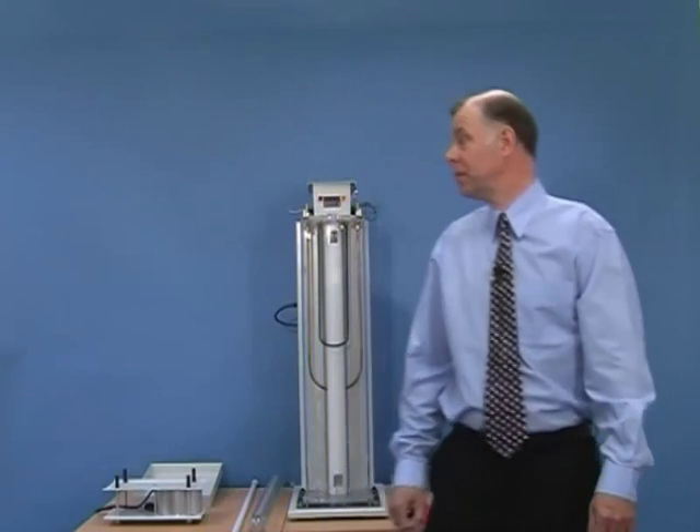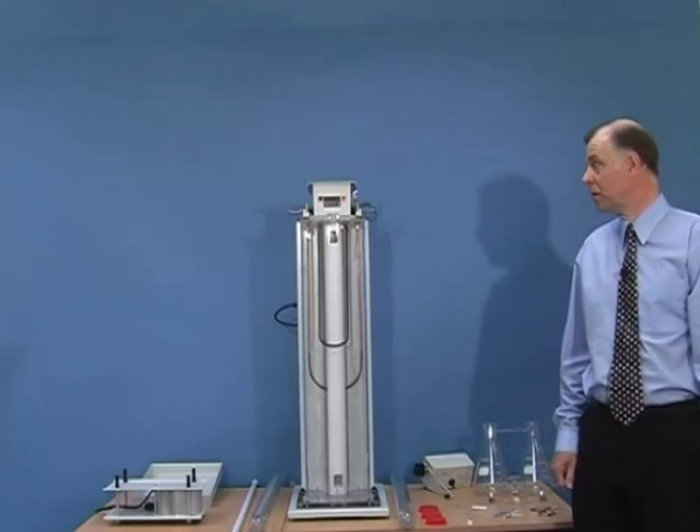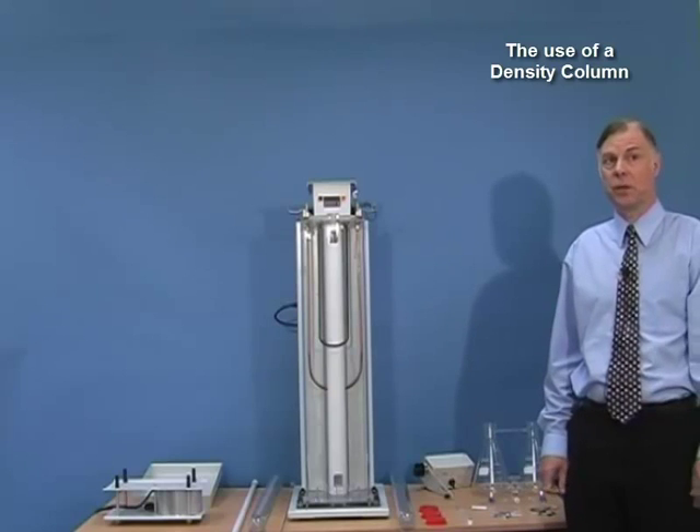Hello and welcome to this session of the Lloyd Instruments training program. The product I'm going to show you is a Davenport density column, and the unit I have here is a two-column device. A density column is used to measure the density of small solid samples using the flotation principle.